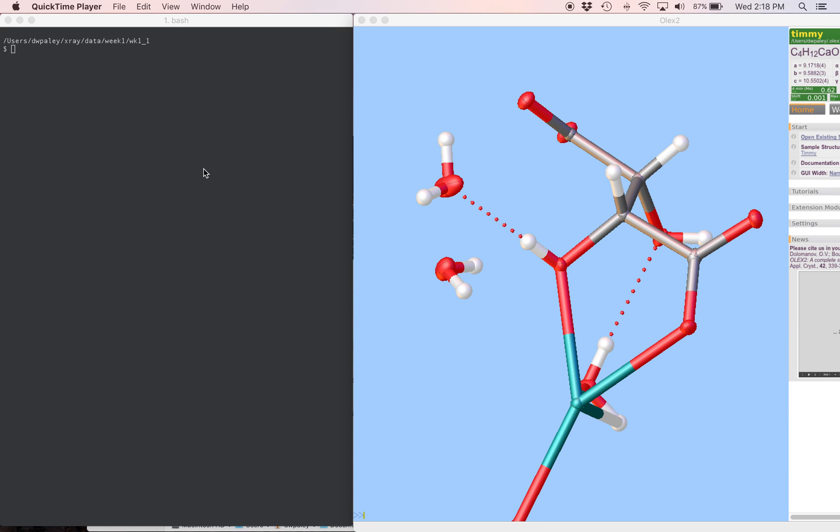Hi, I want to show a couple shortcuts that will make the first stages of working on a new structure a lot more efficient. We won't have to manually enter every atom for the whole rest of the semester like we did on our first structure.